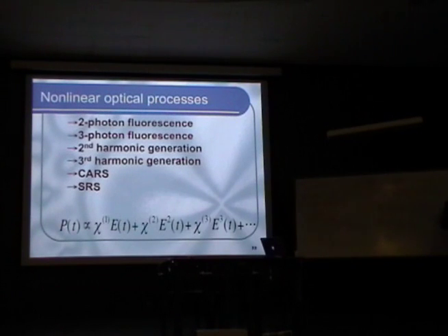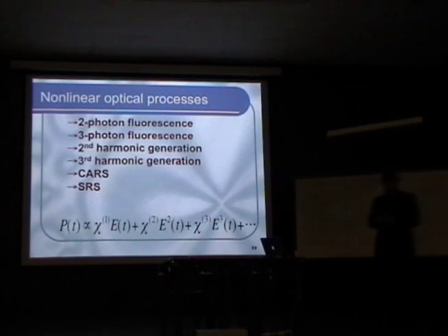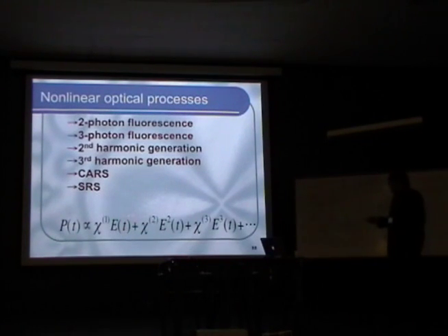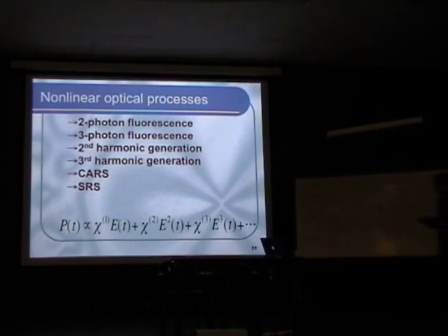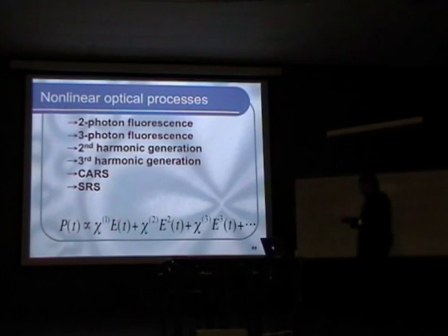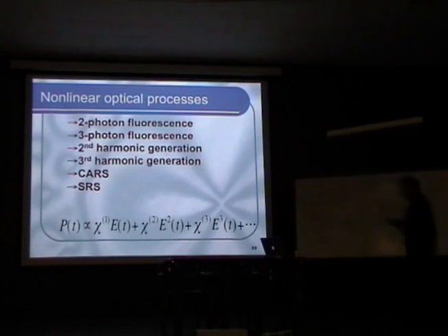So all of the techniques we have discussed so far, they were linear optical microscopy techniques, right? So the processes that those techniques are based on are linear in nature, and so if one were to consider the polarization induced in the material or in the sample probed using those techniques, we essentially dealt with the first term in this expression, where the polarization is linearly proportional to the electric field of the probing light.